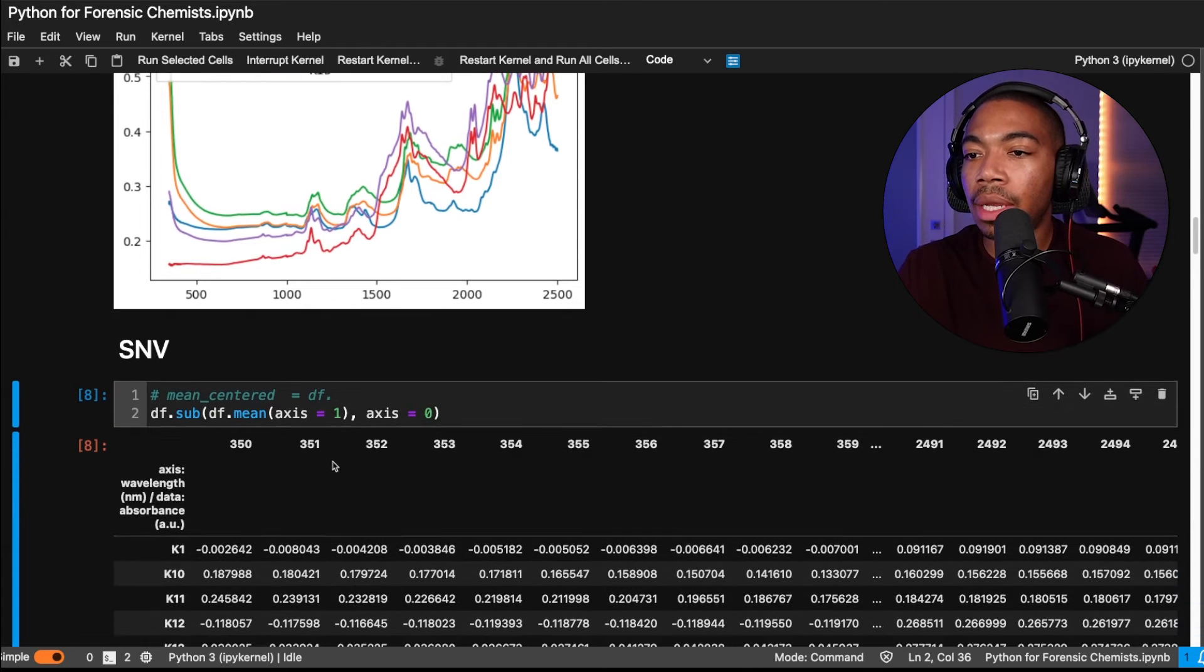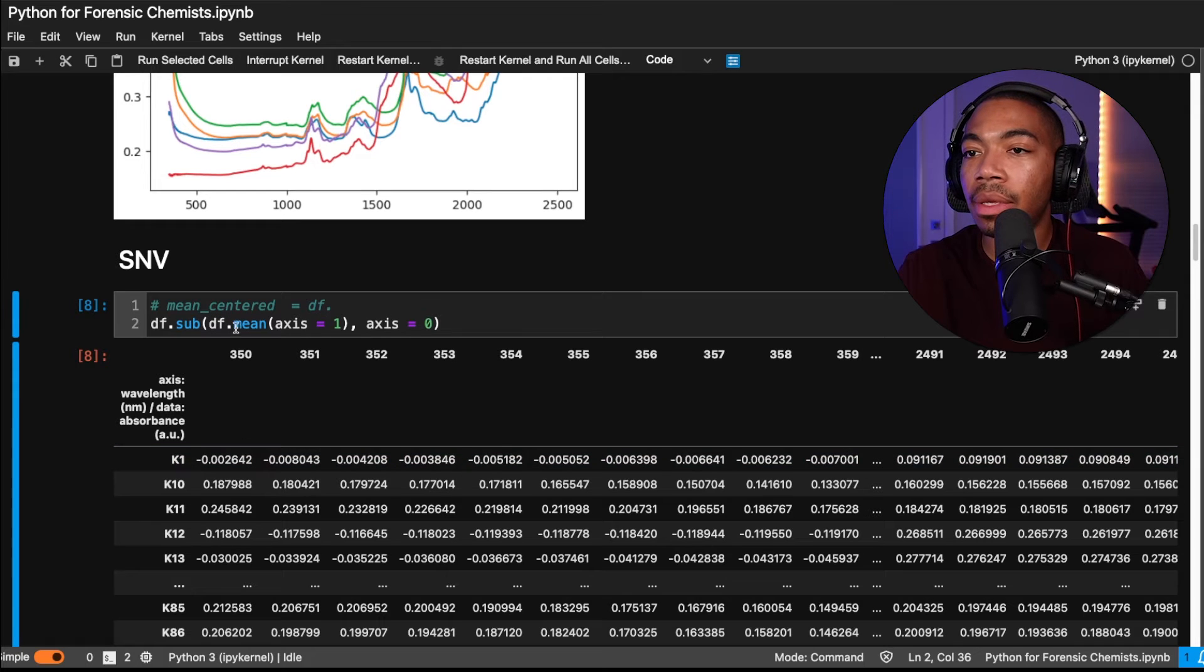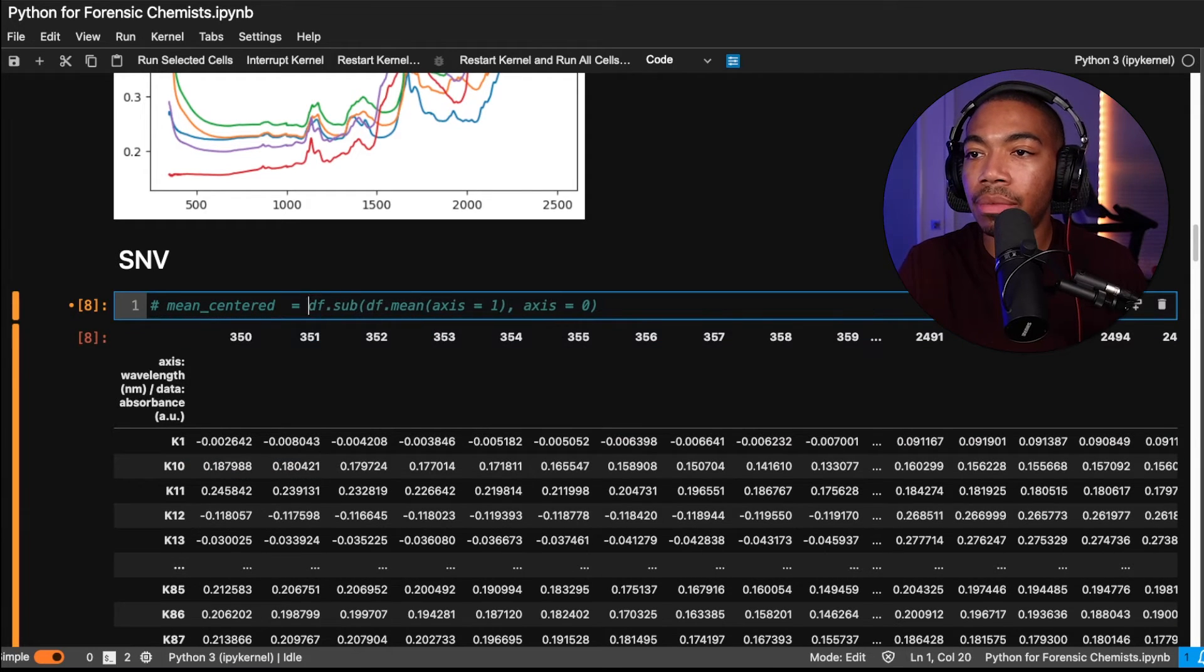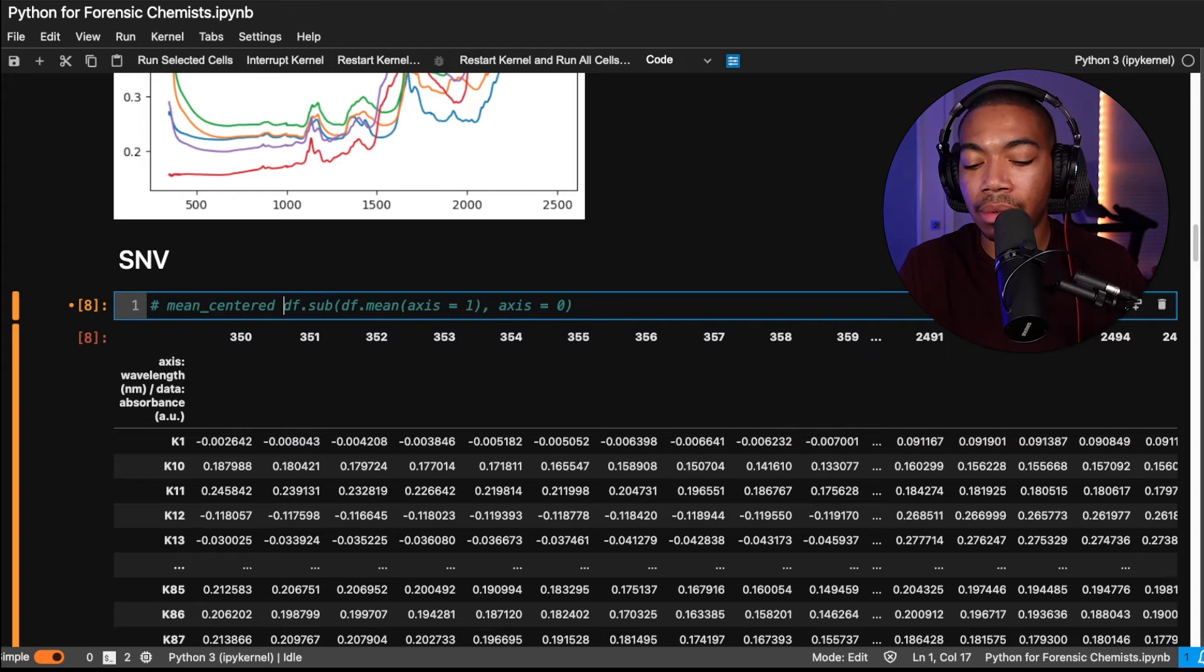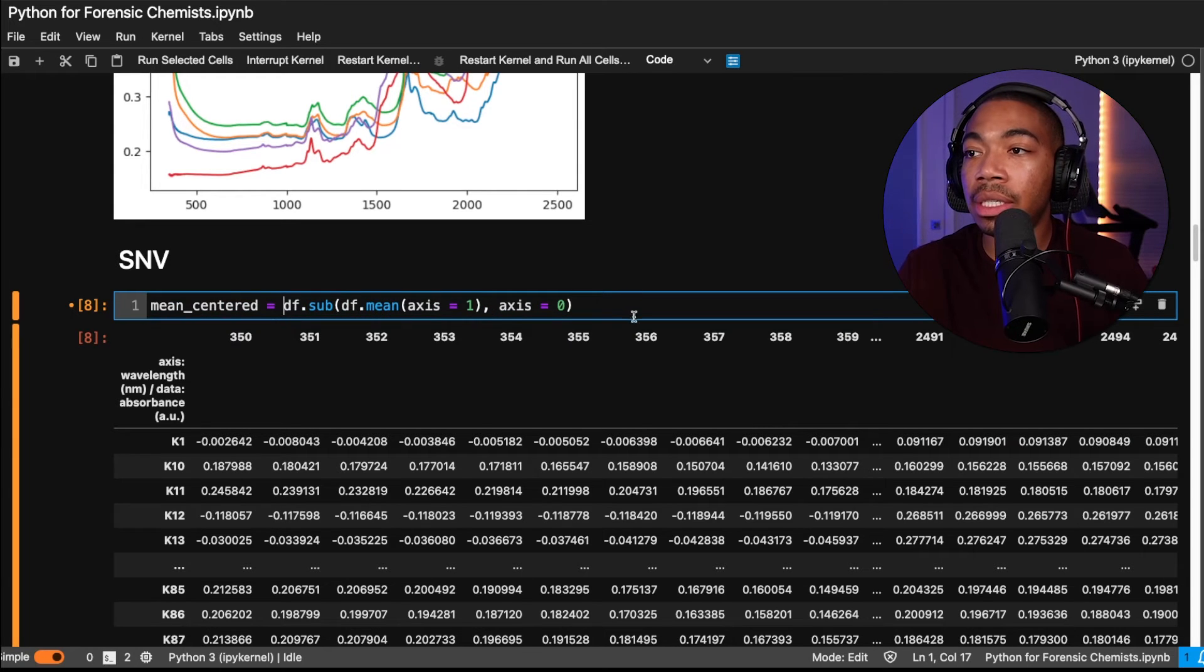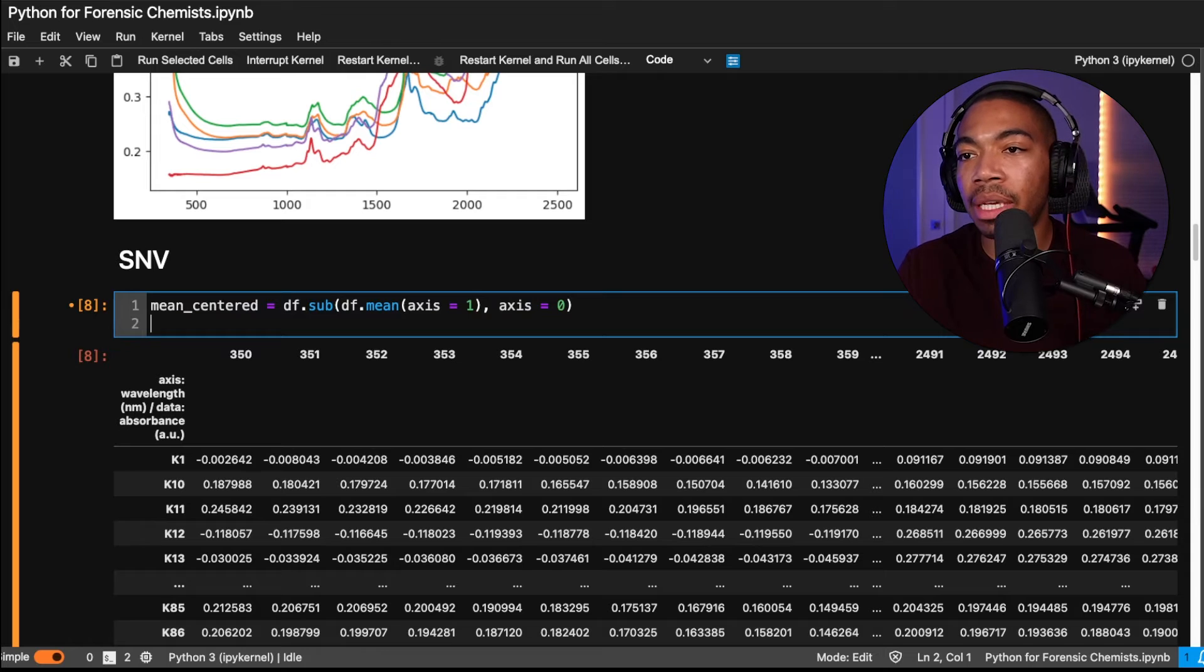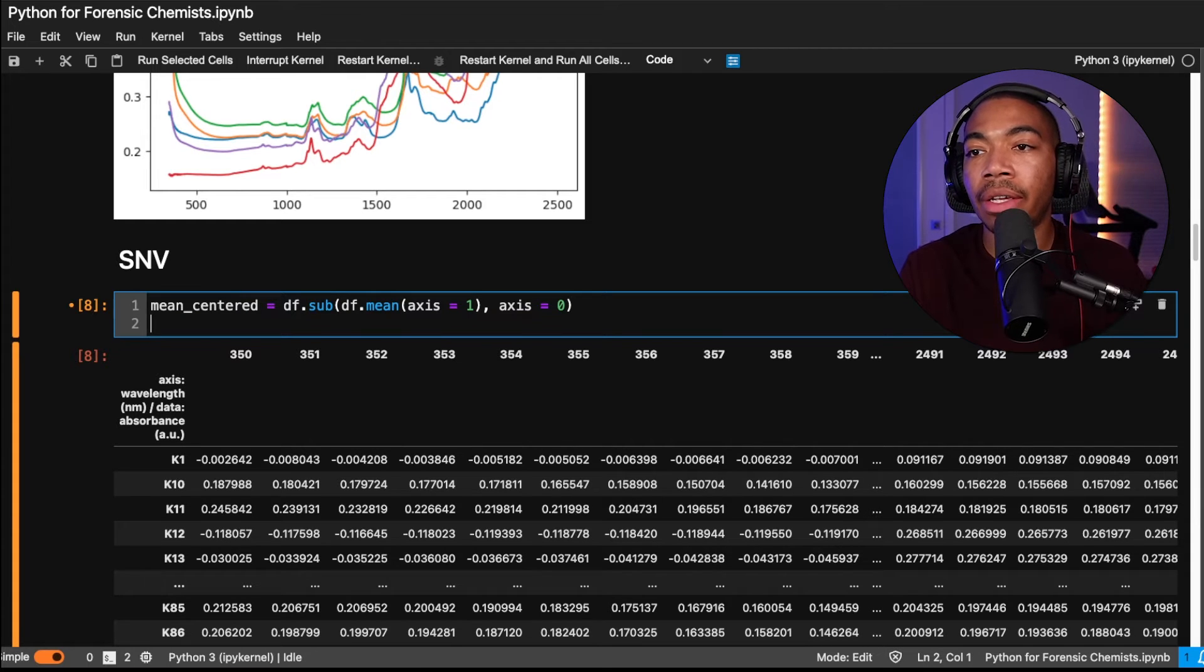And so now we have our mean centered data. And so let's store this as that variable, mean centered equals. So this is just step one in this process, where we have first mean centered the data. And so now we have to control the variance of each of these samples.